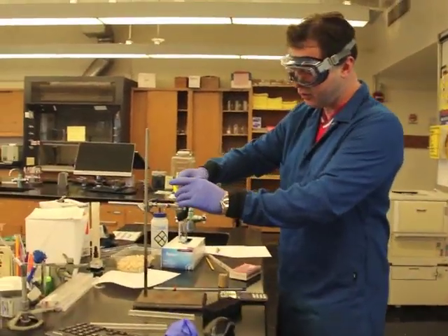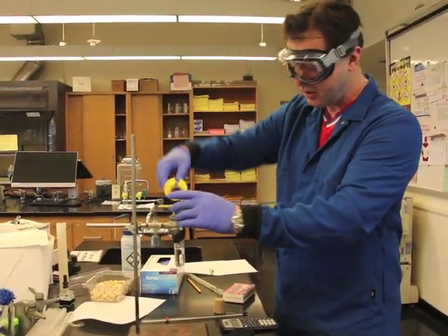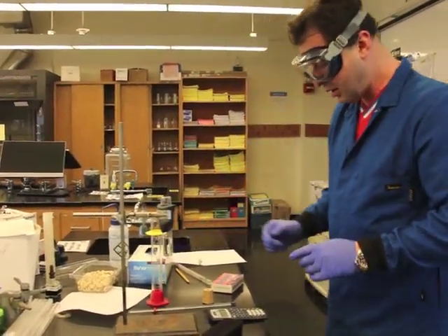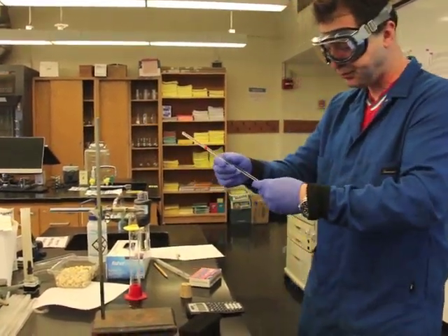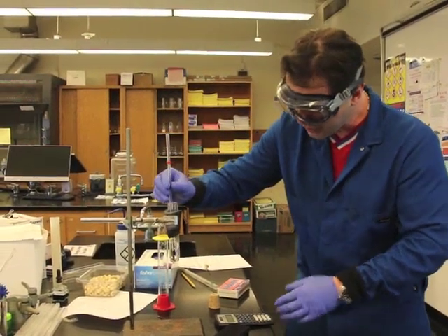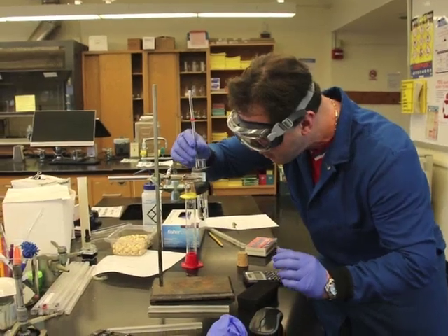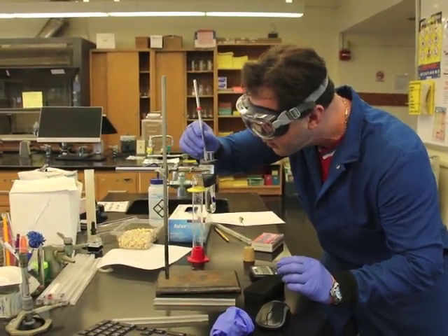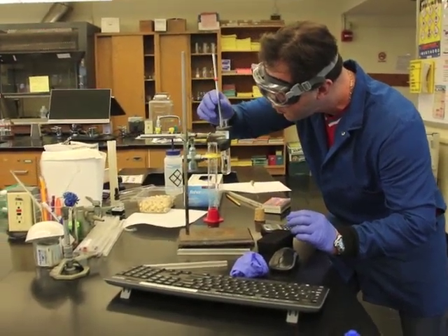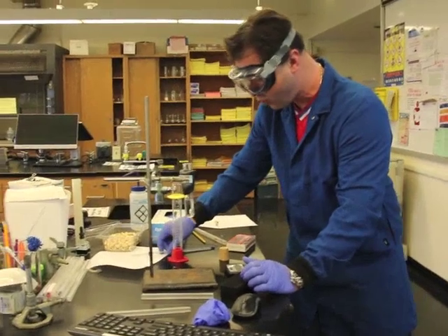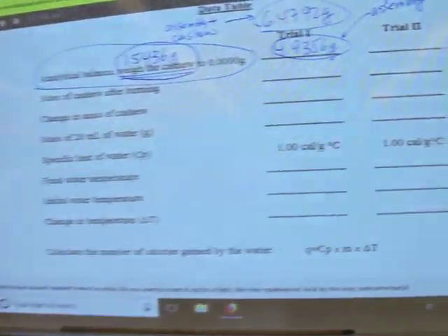I'm going to pour this water into this test tube. I just delivered 20.0 ml of water, so my next step is to measure the temperature of the water. I'm going to position this somewhere in the middle. I got 21.9, that's the initial temperature.